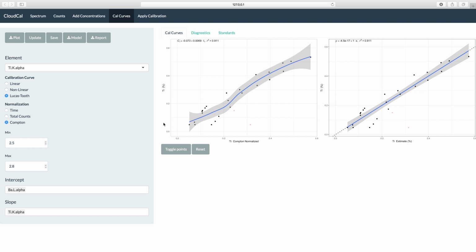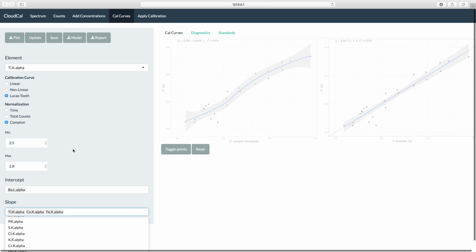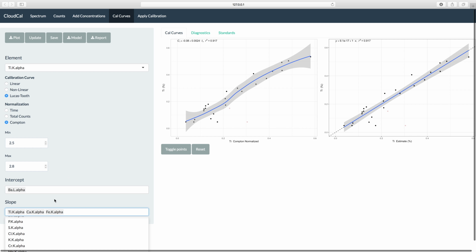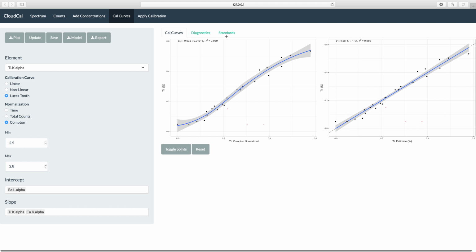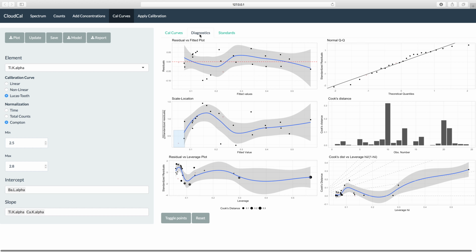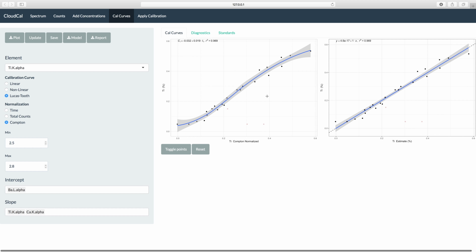So next, what we're going to do is consider slope corrections. It's sandwiched between two big peaks, calcium and iron. Actually, iron doesn't change it too much. We'll get rid of that. But that goes quite a ways. Get rid of that point. We're at 0.97. Come over to diagnostics. Things are looking pretty flat. So I'm happy with that particular regression line. Update. Let's move on to chromium.